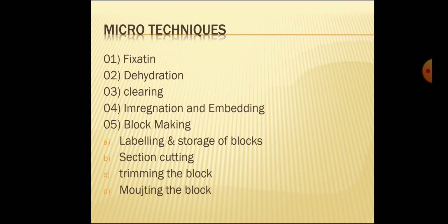In such a way, mounting of the block to the holder takes place, and after that block making, labeling, sectioning, trimming and mounting of the block occur. So in such a way, the microtechnique process is completed. After that, the ribbon formation technique is used.